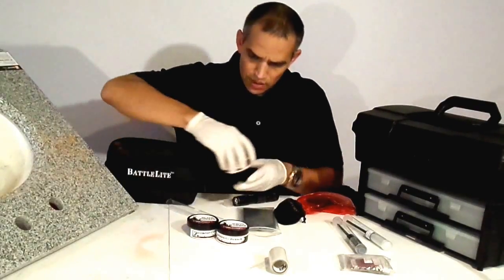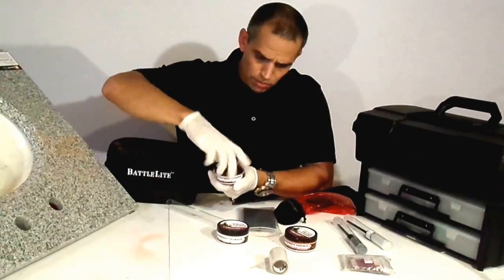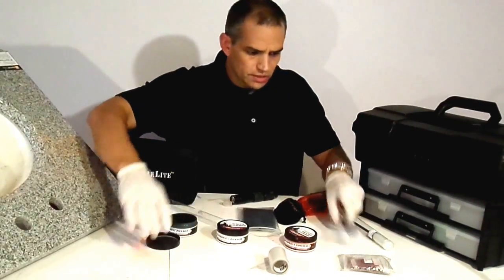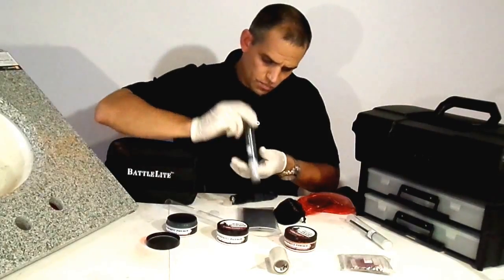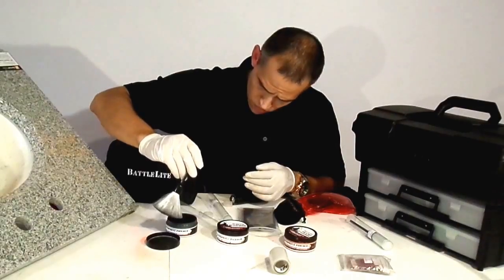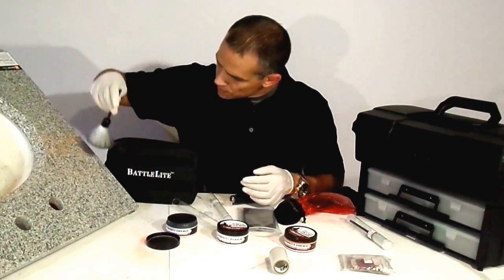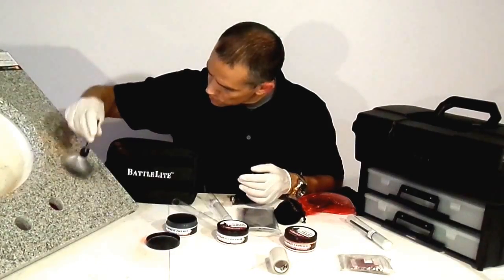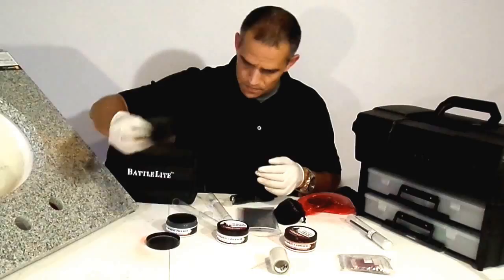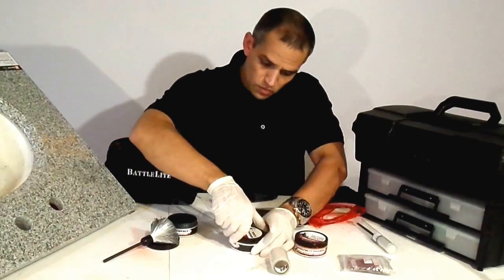Now if we went ahead and tried to develop the same fingerprints using a traditional black powder — I'm going to use a traditional powder brush because I'm very used to that. I'm just going to put a tiny little bit on and then do the black, lay that down here, and then do the same with the white.